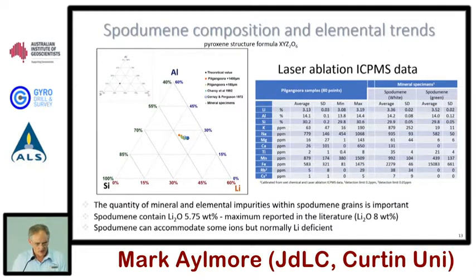With the laser ablation, of course, we want chemical composition information. Not all spodumenes are the same. They have obviously different textures and different alterations, but also the compositions can vary. So it is a lithium aluminium silicate, but it can contain high concentrations of magnesium, calcium, manganese, and iron. You get white spodumene, and you can get green ones, which are associated with impurities.